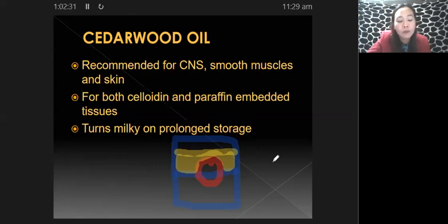Okay, so between xylene or benzene, which one is a better answer? It's actually your benzene. Benzene is a better answer because it is the one that is mentioned by Gregorius. If I'm not mistaken, I got xylene in one of the references in histopath written by Anne Priest.